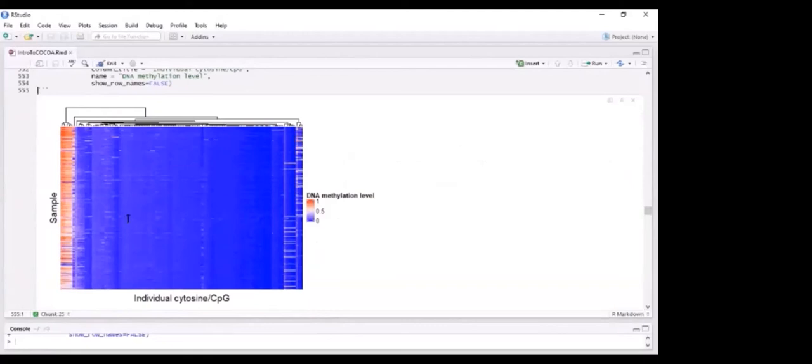These are the 100 CpGs that have the highest correlation, but even selecting the best CpGs, there's hardly any correlation along the principal component 1 axis in this region set, which is why this region set gets a low COCO score for principal component 1.